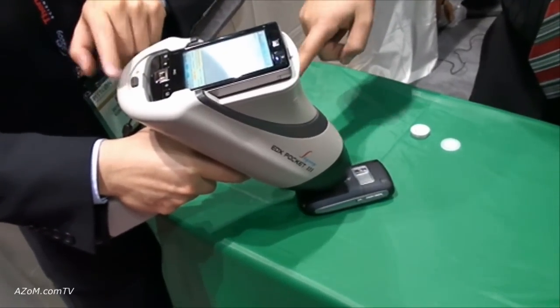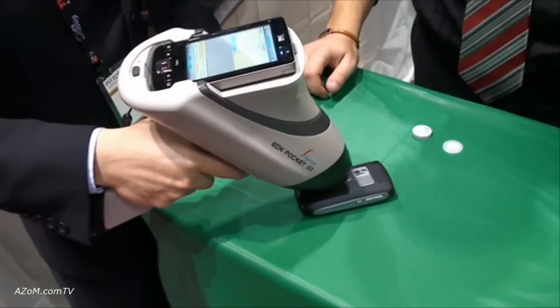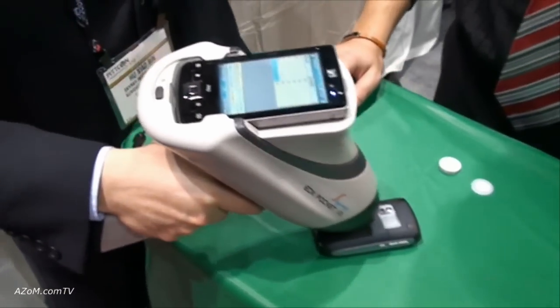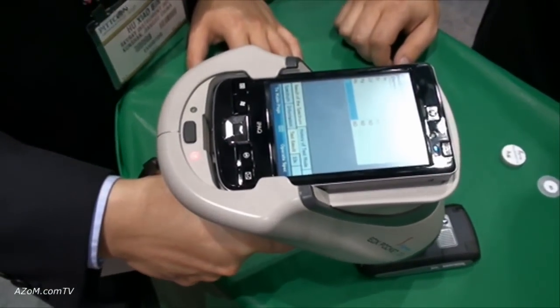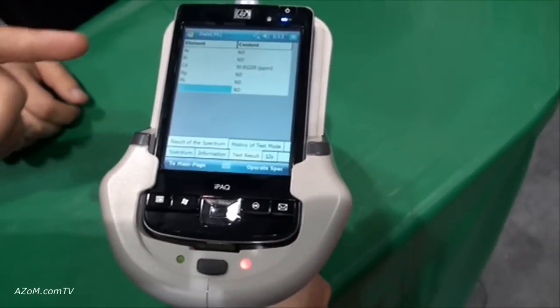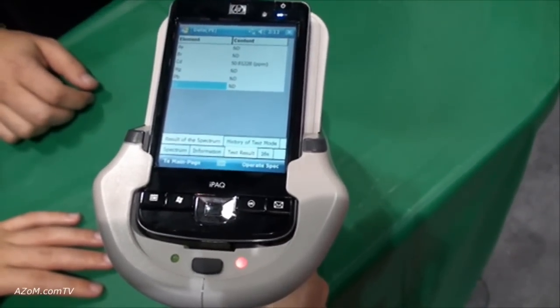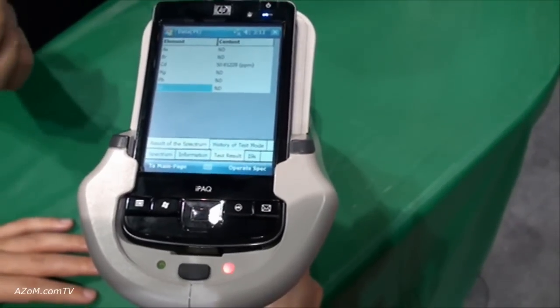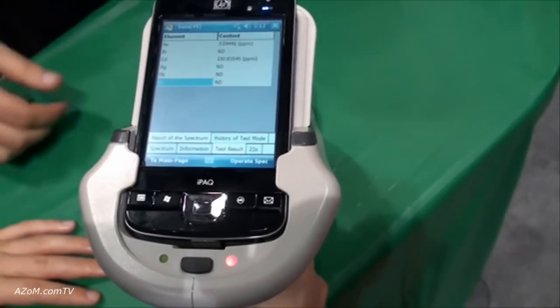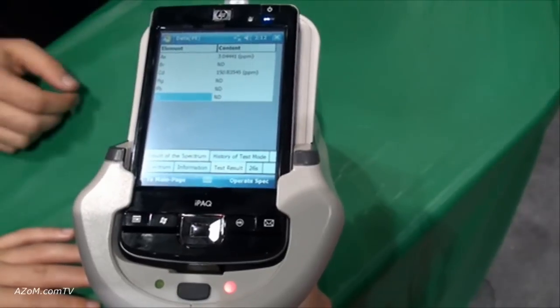Once you press the button through the trigger, the red light turns on meaning the X-ray is on. And within a few seconds you're going to be getting your results. Here you can see the results — this is in parts per million — so when you're running tests for your mercury, your cadmium, and your other elements you'll know in parts per million. And here you can see very fine results detecting down to three parts per million.